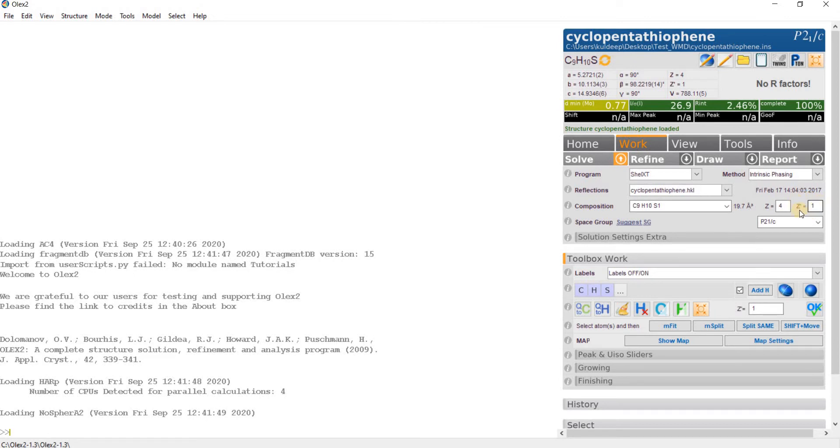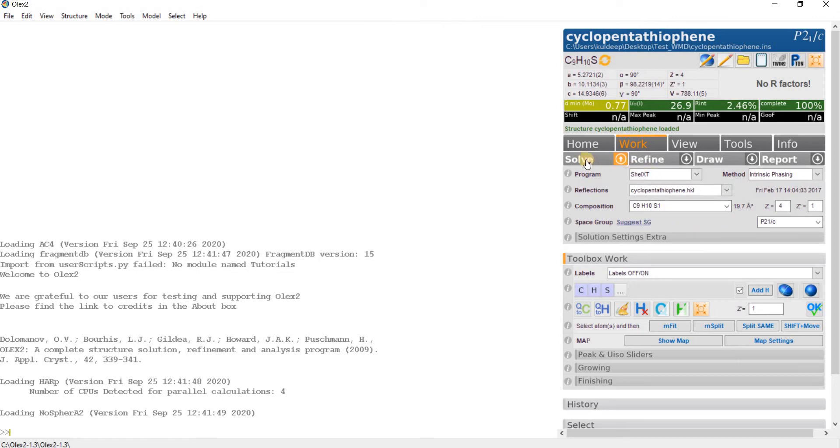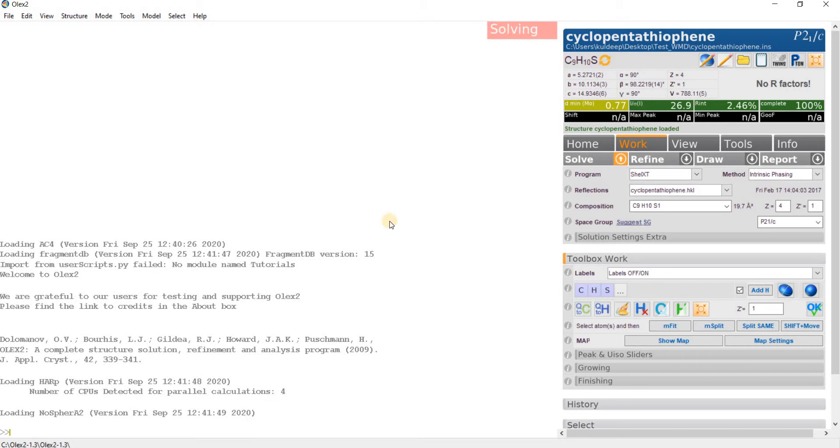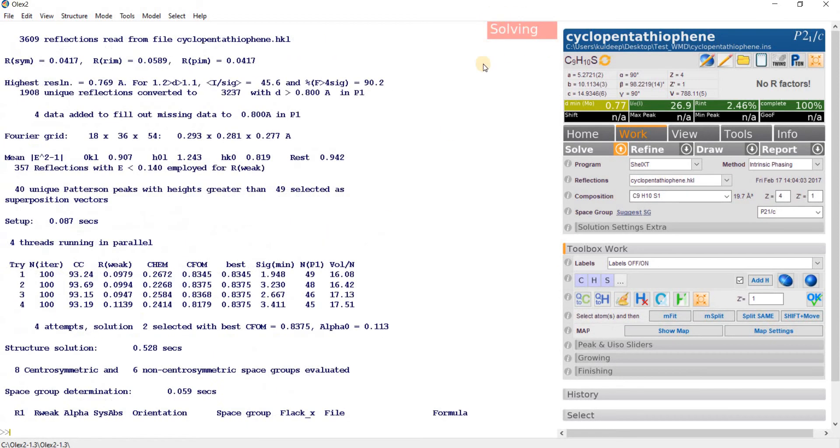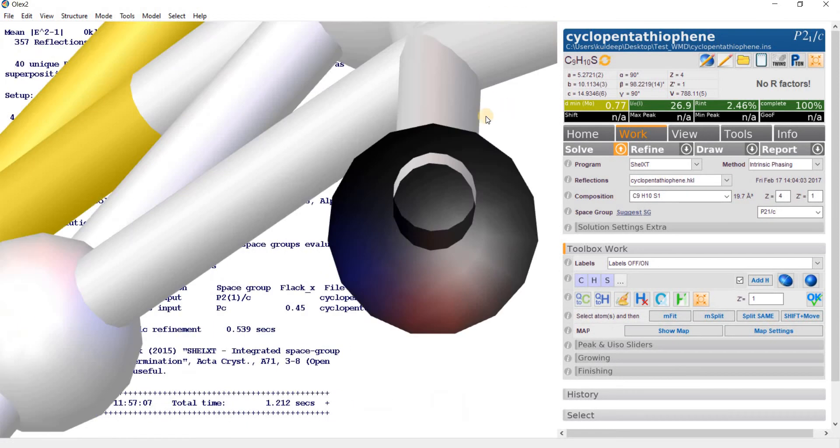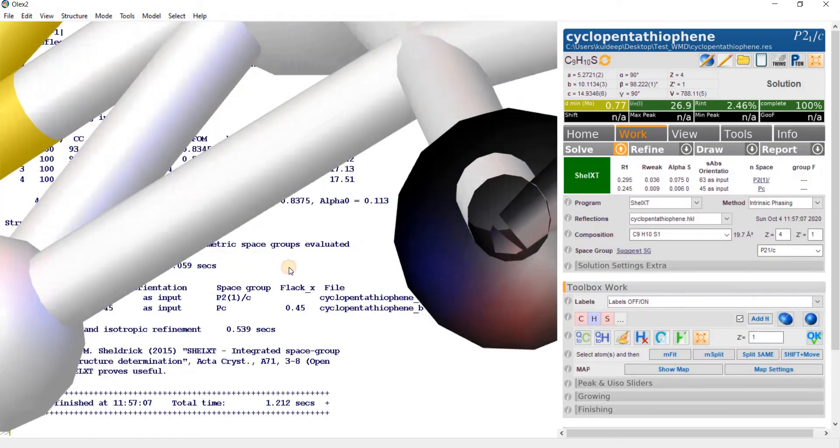The value of Z, the formula unit present per unit cell is 4. The number of molecules present per asymmetric unit is 1, Z' = 1. The molecule crystallizes in monoclinic centrosymmetric space group P21/C. Now go to solve and press the solve button, or alternatively you can type solve and press enter.